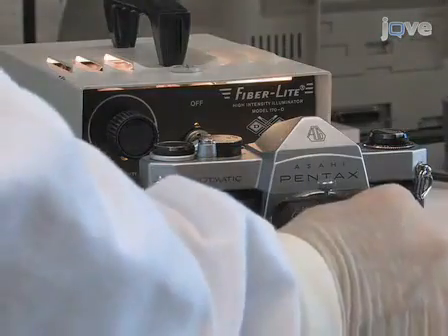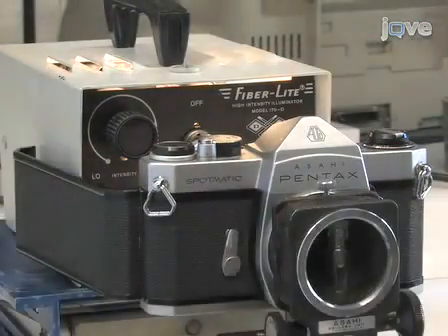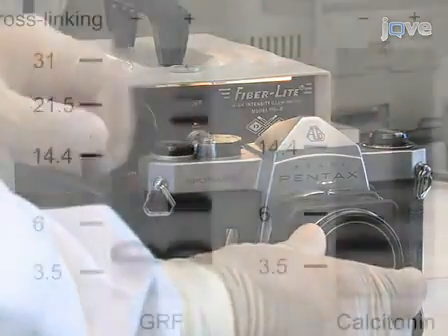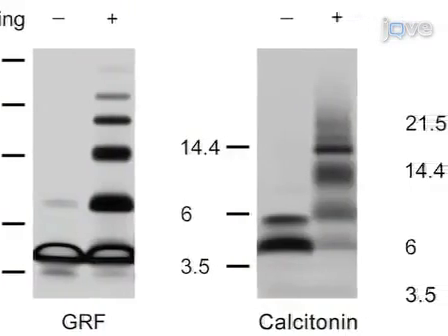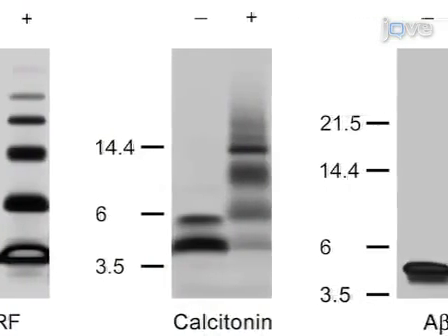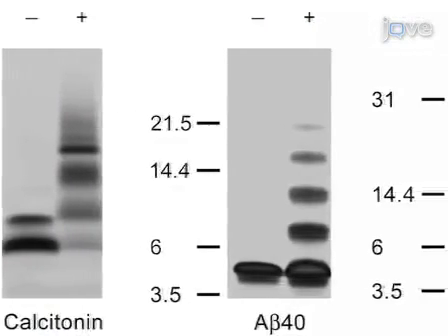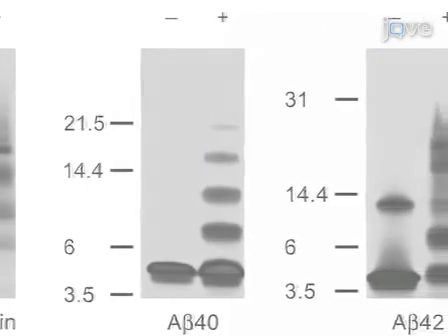This procedure was initially published by Fancy and Kodadek to study stable protein complexes. The method was applied later by Bitan and others to quantitative study of metastable amyloid protein assemblies, including amyloid beta, prion, and alpha-synuclein. So let's get started.